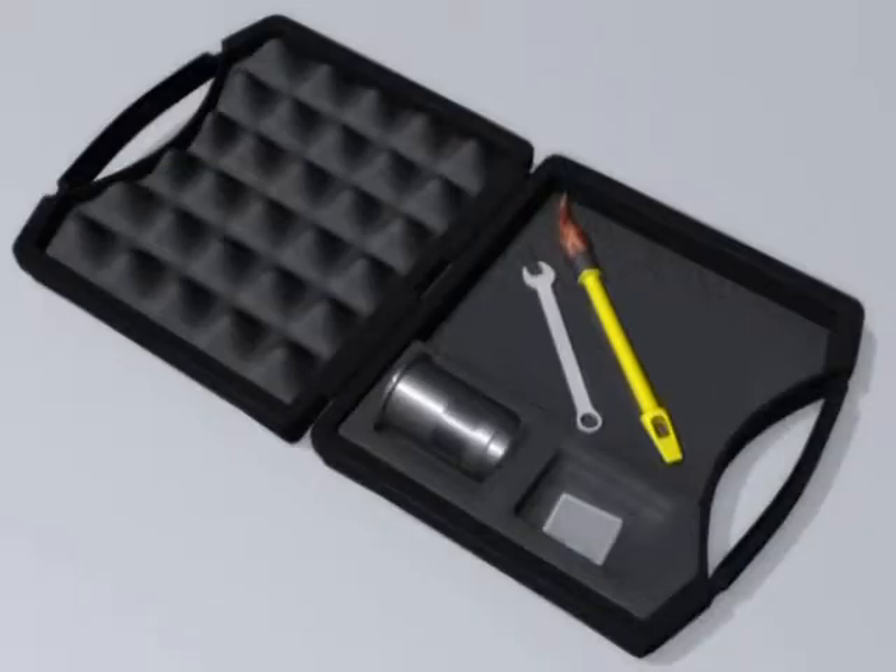Place the sample cell you have removed into the accessory kit for safekeeping. There are two square holes cut into the foam padding for the storage of additional sample cells.